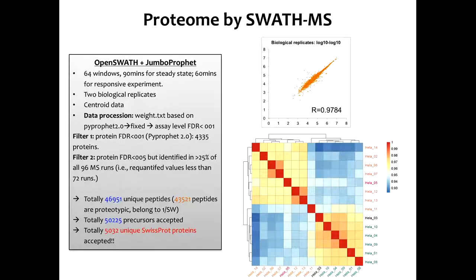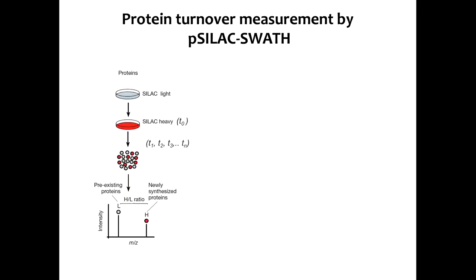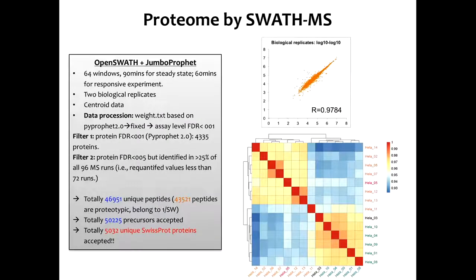Yansheng analyzed the proteome from each one of these cell lines, using exactly the techniques that we learned here this week, and he consistently identified about 4,500 to 5,000 proteins in the cells. And then you can do clustering. You see these clusters appearing, and the Kyoto and the other groups are clustering together, are apart, and within each cluster there are also quite substantial differences. I'll come back to what this means, just now enumerating what was done.